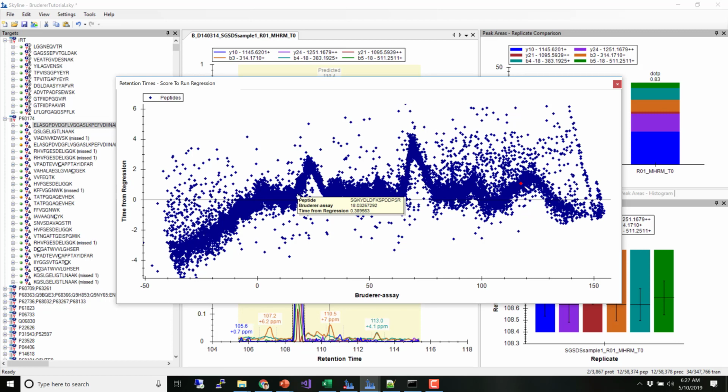the iRTs. Those are the original predictions derived from the DDA data, and this is not Skyline's algorithm. Now I'm kind of interested to run that MaxQuant library that we created this morning and see whether Skyline's iRT predictions differ. It's hard to know whether this is an artifact of the DDA data or of how their iRT picking works. But when we run our model, I think we're going to find with these data that retention time turns out not to be a super strong score.